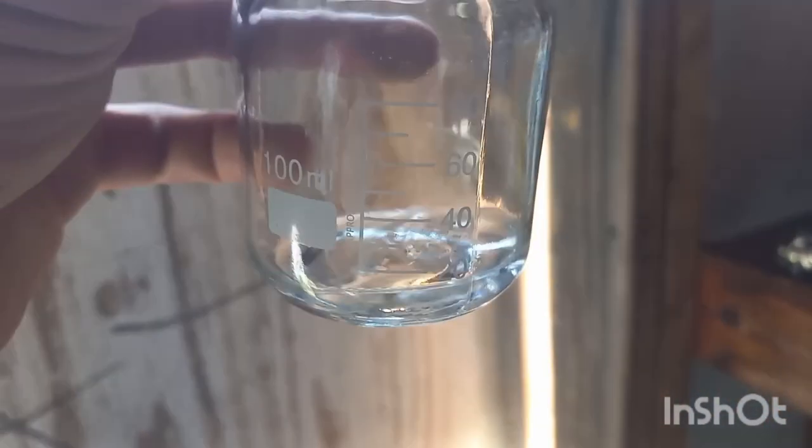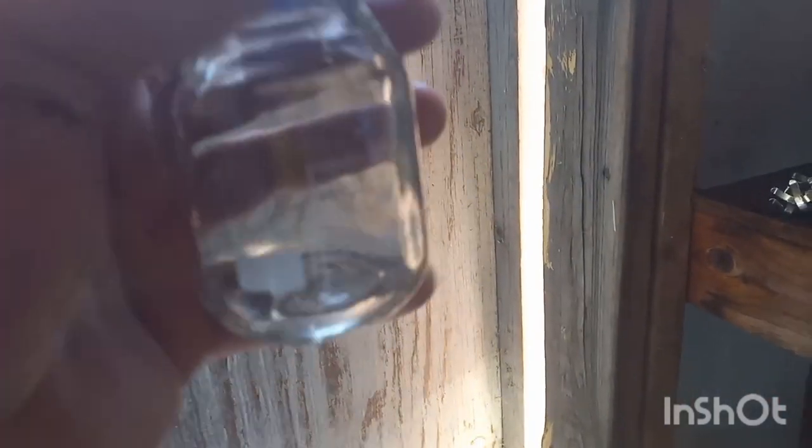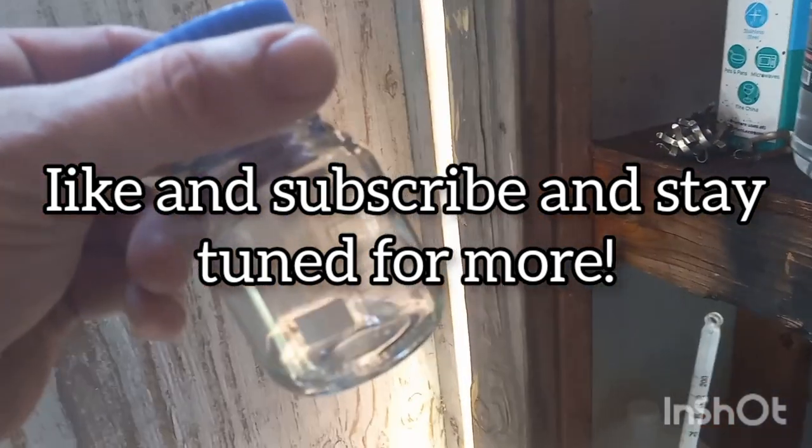Probably should have used a fractionation column. Would have got better results. So maybe that's what I'll do with the next 2 bottles. But I just really wanted to finish this video and have a pure sample. So, there we go. Pure dimethyl carbonate.